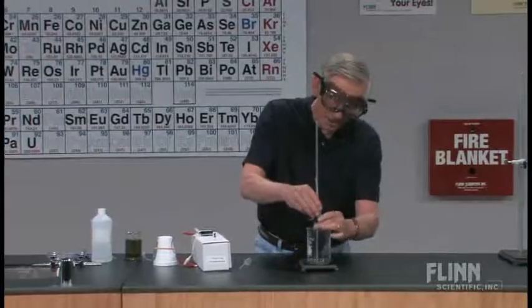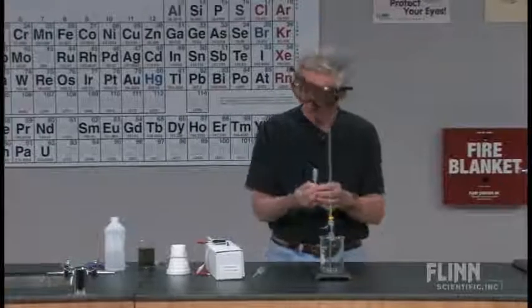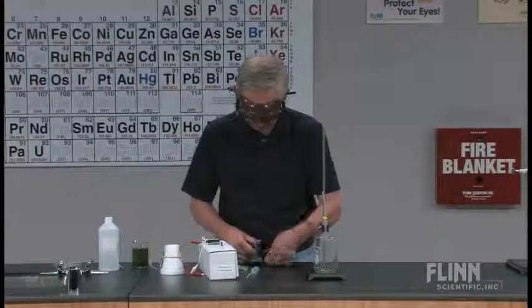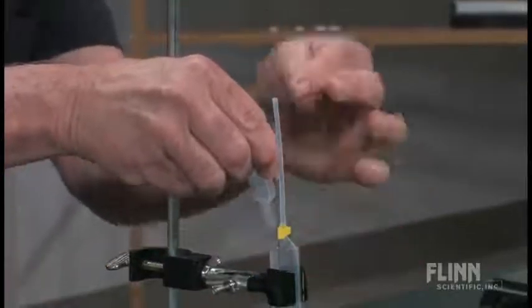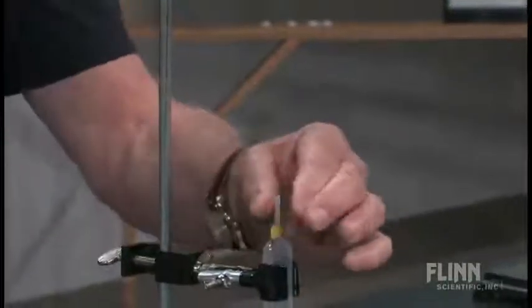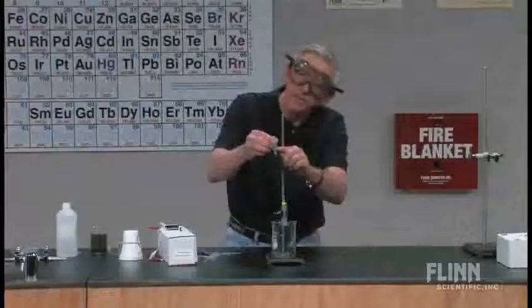So my electrolysis is going to take place in the electrolysis chamber that I just built. I need something to collect those gases in, so I'm going to take another pipette and cut it off like this. I'm going to fill this with water, invert it over the stem. I don't need all this plastic, so I'm going to cut this about here. Then I kind of measure it because I want to make sure that the tip of this one is up past the shoulder here.